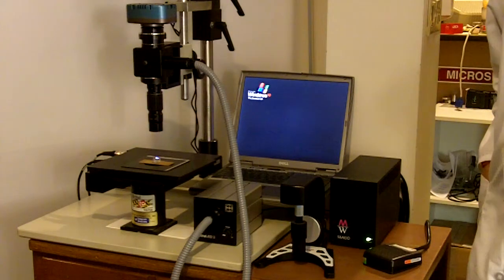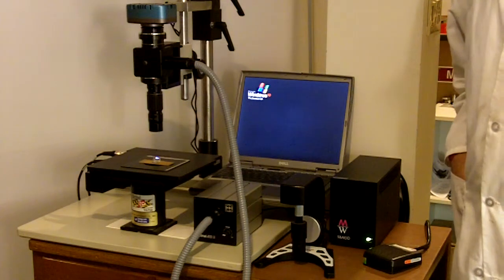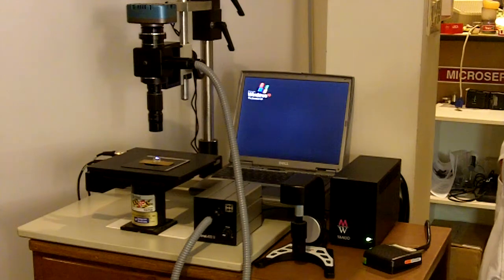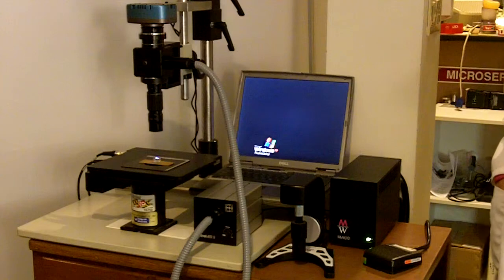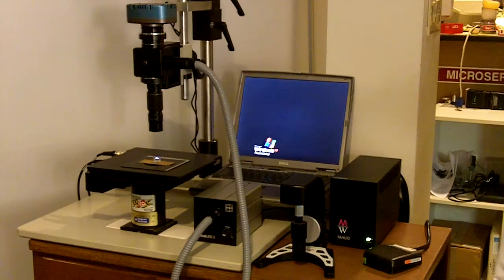Retrofloor, a modular microscope set up for incident light fluorescence microscopy.